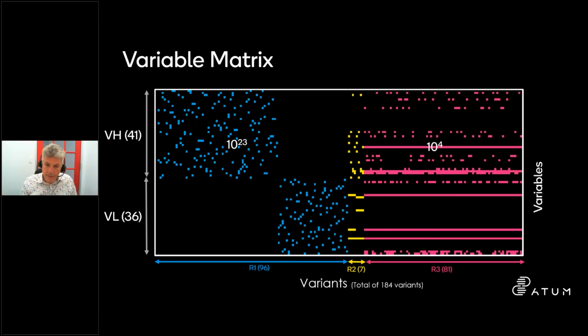So by just weeding out the bad substitutions, we can very rapidly narrow this down, by only making 96 sequences in this 10 to the 23 space. We can very rapidly narrow down all this garbage, keep all the good substitutions, and drill down to, in this case, 10 to the 4, which is all of a sudden a very manageable space. And we search that space, in this case, with just 81 sequences.